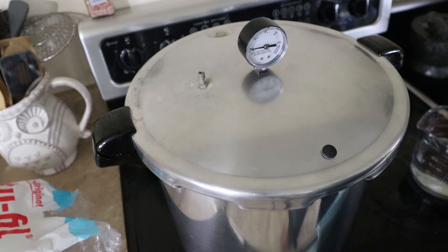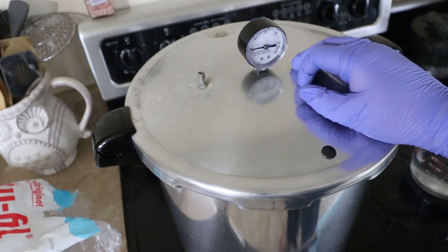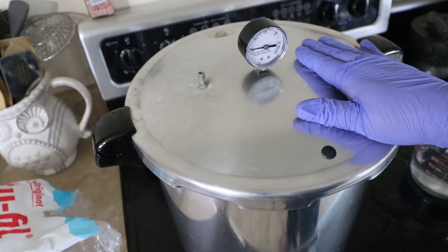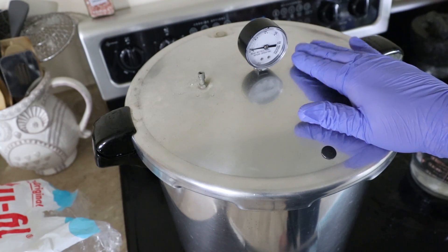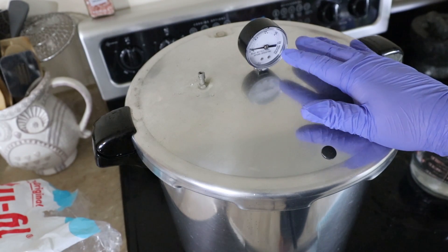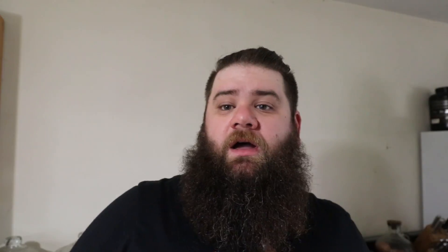Line everything up, close it. You're going to cook it at 15 psi for 30 minutes and then let it cool. Usually I'll let it cool for an hour and then pour, if I'm ready to do it right then. If not, I will take this pressure cooker, let it cool overnight, and then put it on a hot plate and let it warm back up for about an hour, and after the agar is melted I can pour it then.